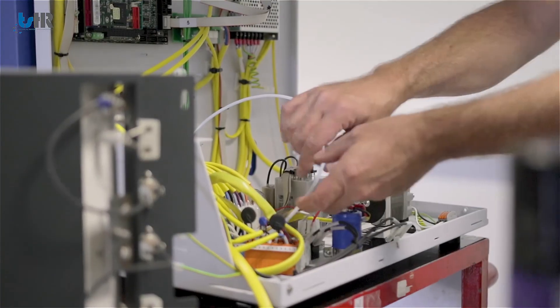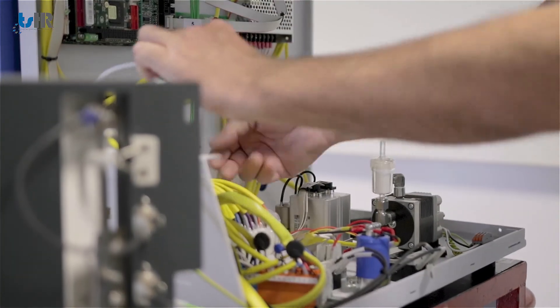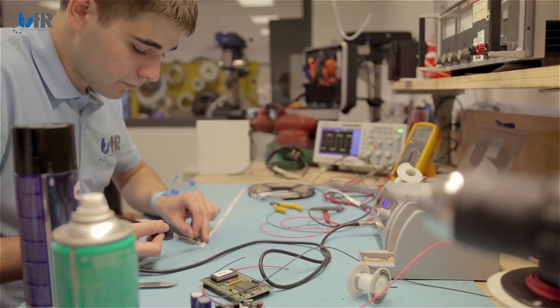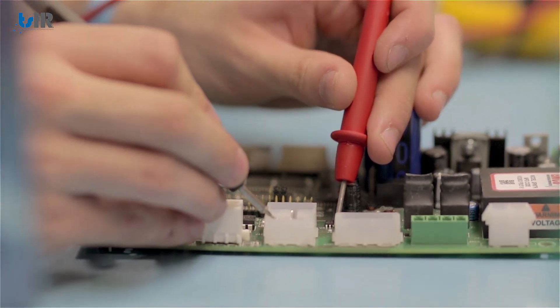Nowadays we develop and manufacture out of our factory in Rotterdam, the Netherlands, combustion elemental analyzer solutions which are in compliance with international standards like ASTM, UOP and ISO.